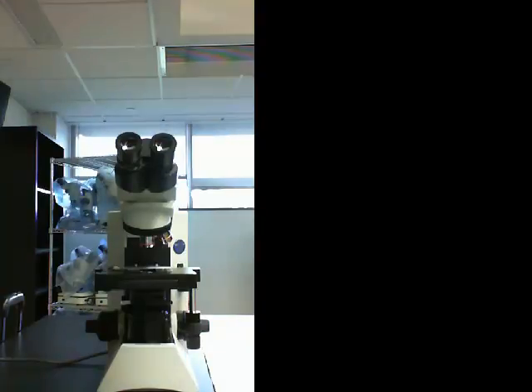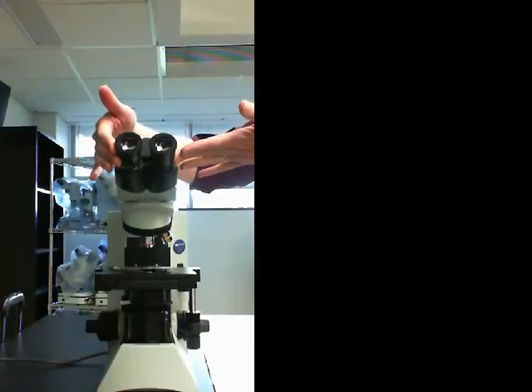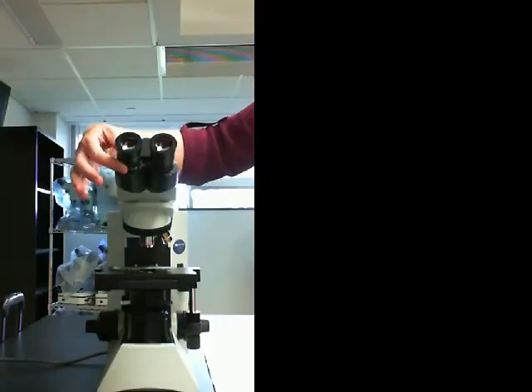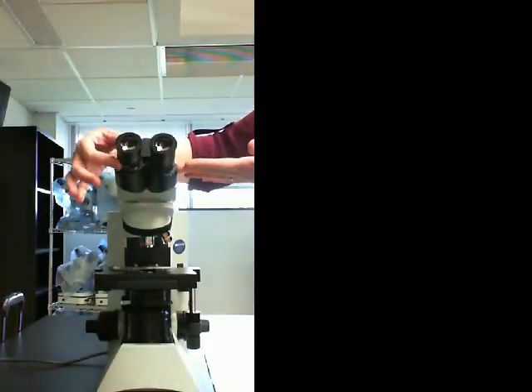The final pieces that we have here are our lenses. So we have our ocular lenses right here, or our eyepieces that you're going to be looking through. One of these is able to focus independently of the other, and we'll talk about optimizing your focus with this ocular adjustment lens in just a moment.